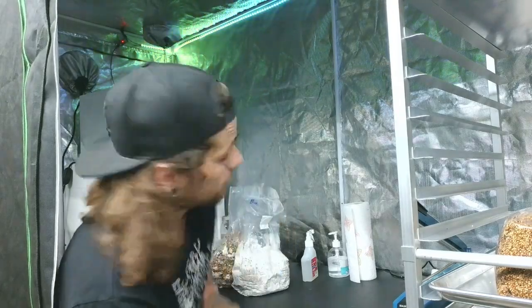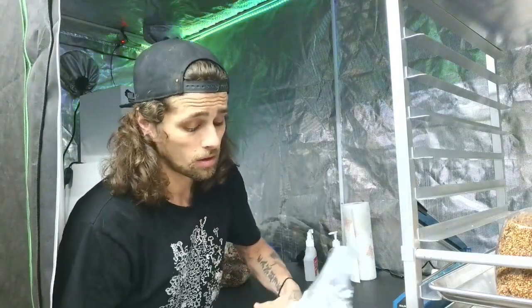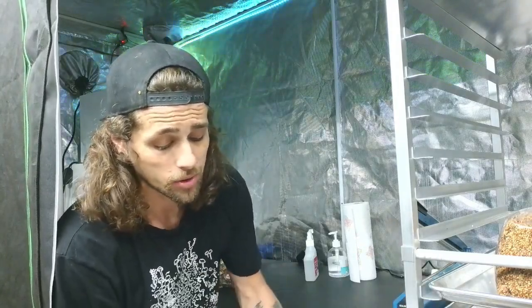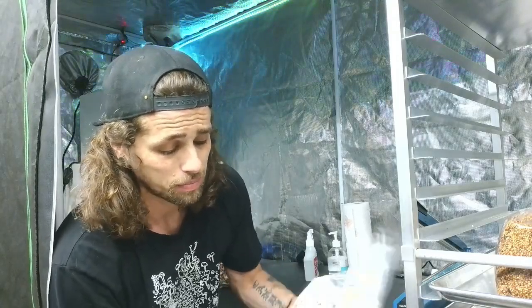I have some blue oyster mushroom spawn right here and we're going to break it up. I always like to do this in front of the flow hood. Even though you can inoculate blue oyster mushrooms in open air, it doesn't hurt to just be a little safer and cleaner and do it in front of the flow hood.